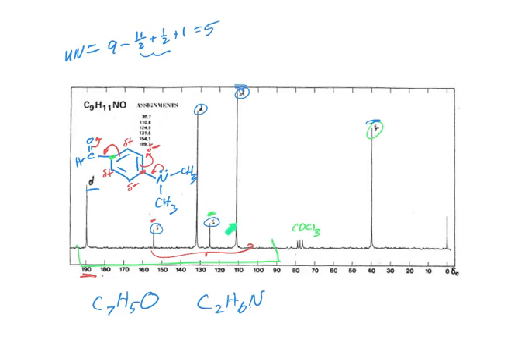Which carbons does that go to? The ortho from the nitrogen group. Right, ortho from the nitrogen. So if I put these in yellow here and here, that's going to be this carbon. And the other two, I don't have another color here, use black, I guess. This one would be these two, right, because that aldehyde is electron withdrawing.